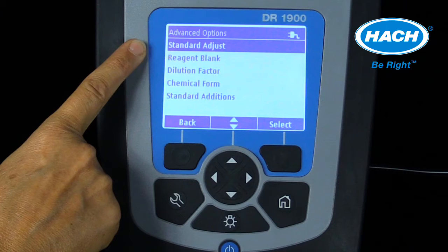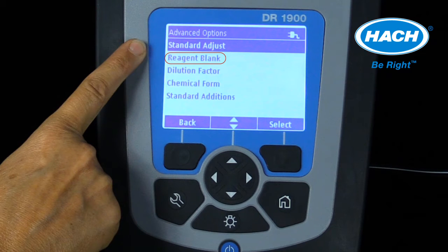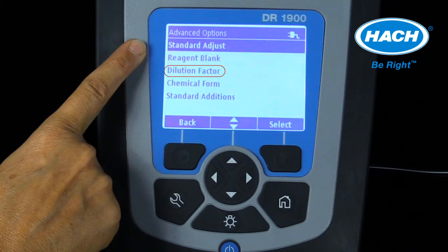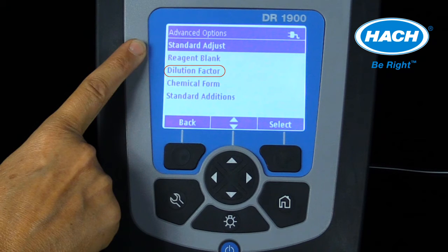The advanced options menu provides the ability to manipulate the measurement results in a number of ways. The standard adjust setting is used to adjust the results based on the measurement of a known standard solution of known concentration. Using the reagent blank option automatically subtracts the color due to the reagents, determined by testing deionized water from subsequent samples measured. The dilution factor setting can be used if the sample was diluted to lower its concentration to fit within the concentration range of the program. This calculated dilution factor can be entered into the DR-1900, and subsequent measurements will then be multiplied by that entered factor.